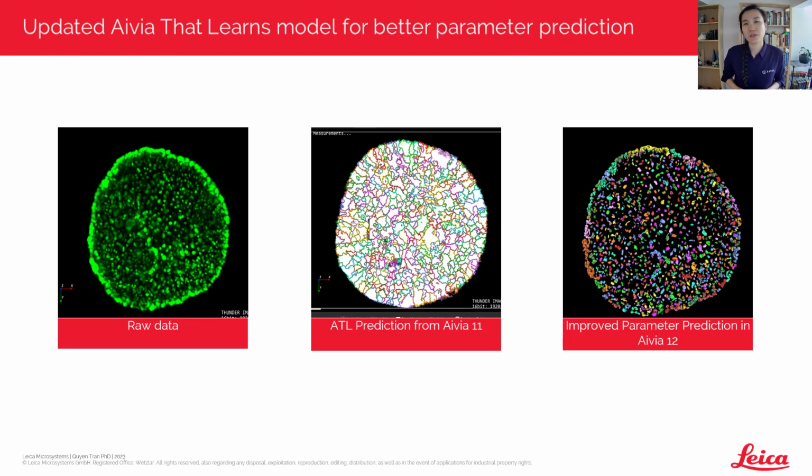With our new Aivia that learns model, the parameter prediction for this particular data set and other data sets have improved. So it is a much better starting point for you to create your analysis results.